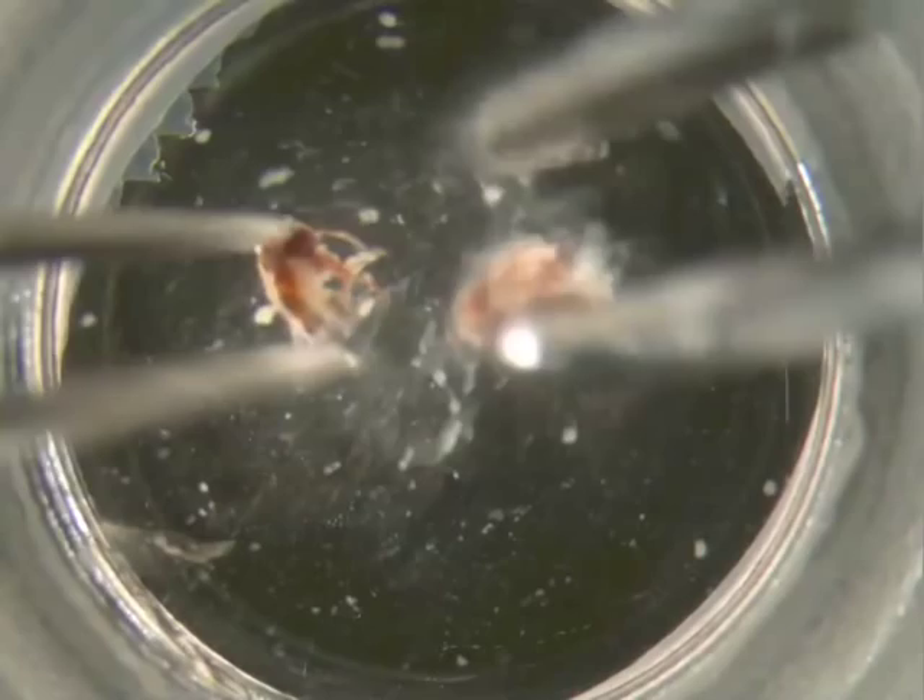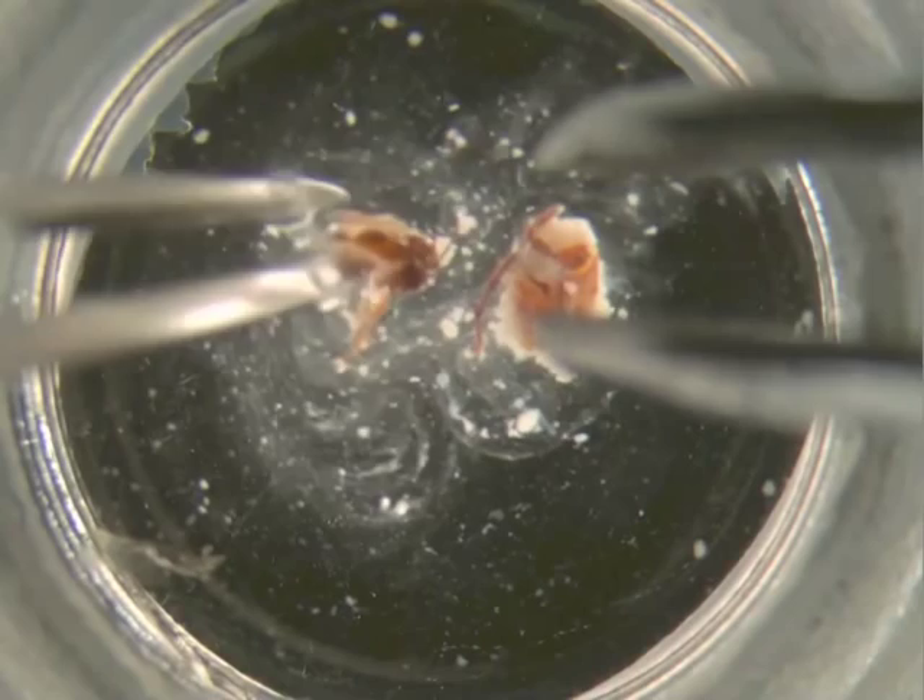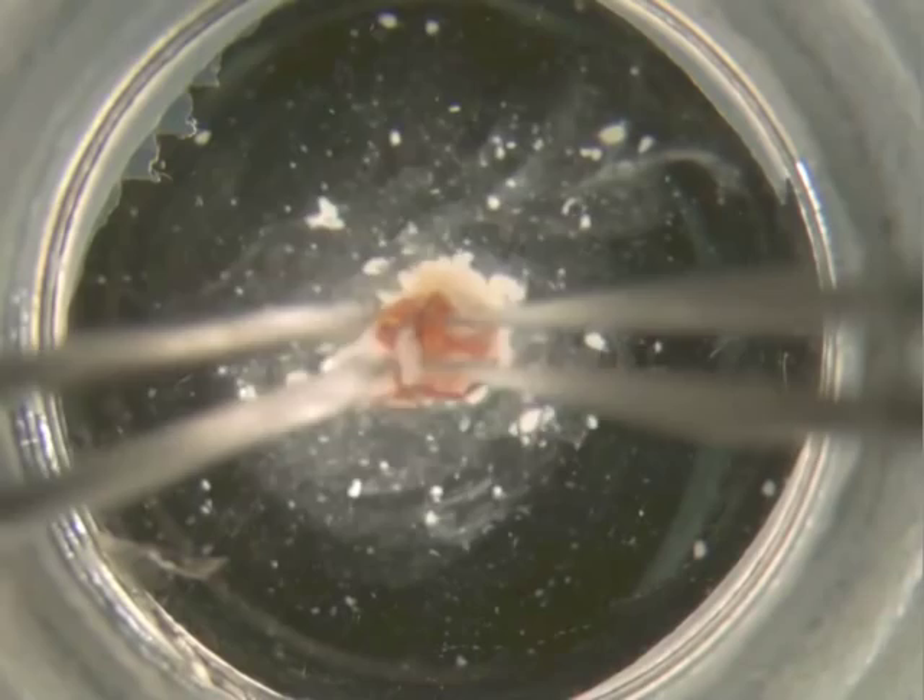Once you've removed the head, take it out of the dissecting dish. Dab your forceps tip onto a kim wipe. Make sure that you get all of the head and leg portion out of the dissecting dish.